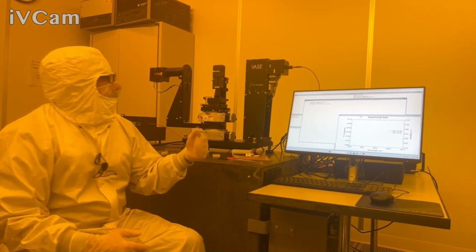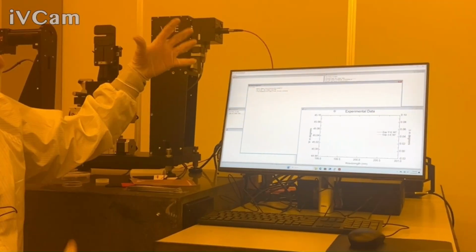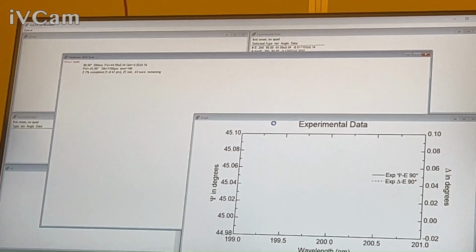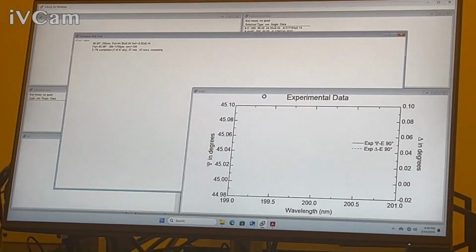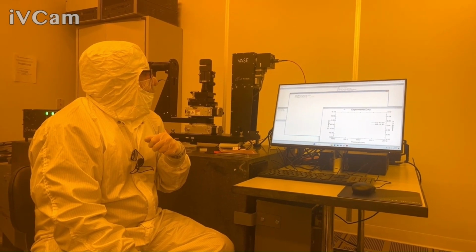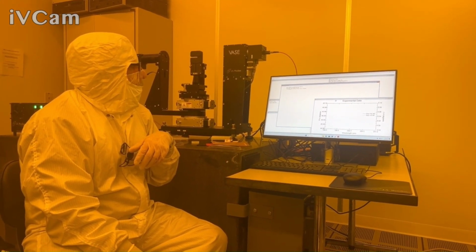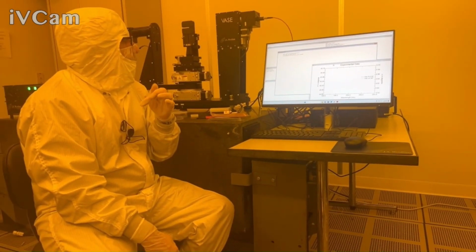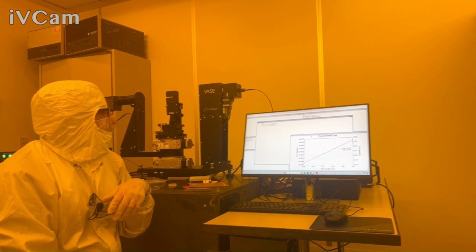And so again, this will probably take another 15. The first one's always going to be a little bit off on the estimate because it was moving stuff around. So usually give it 2 or 3 points to get a better estimate on the time. Okay, it's about 20 minutes.